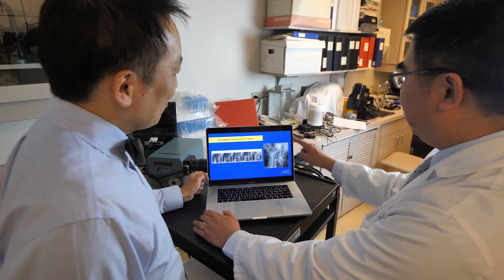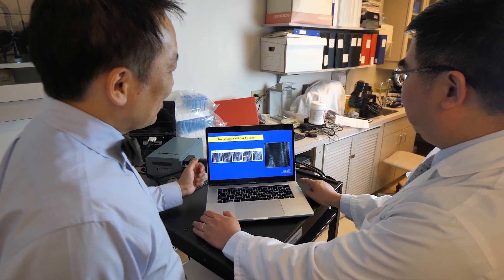So here in this video, we're imaging some blood vessels. In the center of the blood vessel, we're aiming the laser beam. We're generating a localized area of heat that will then spread to the wall of the blood vessel, causing it to collapse. You'll see that the blood vessels nearby are completely unaffected. Using a multi-photon approach, we can achieve highly specific and highly selective closure of a single vessel.